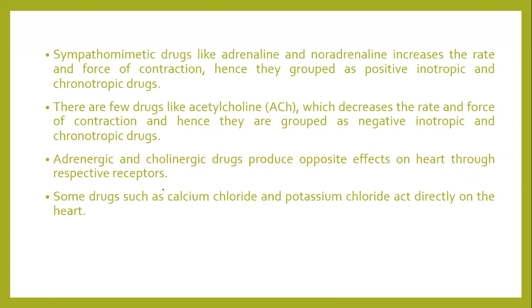So continuing with the principle, the sympathomimetic drugs, as you have studied in last semester, are the ones that mimic the action of noradrenaline at its receptor.